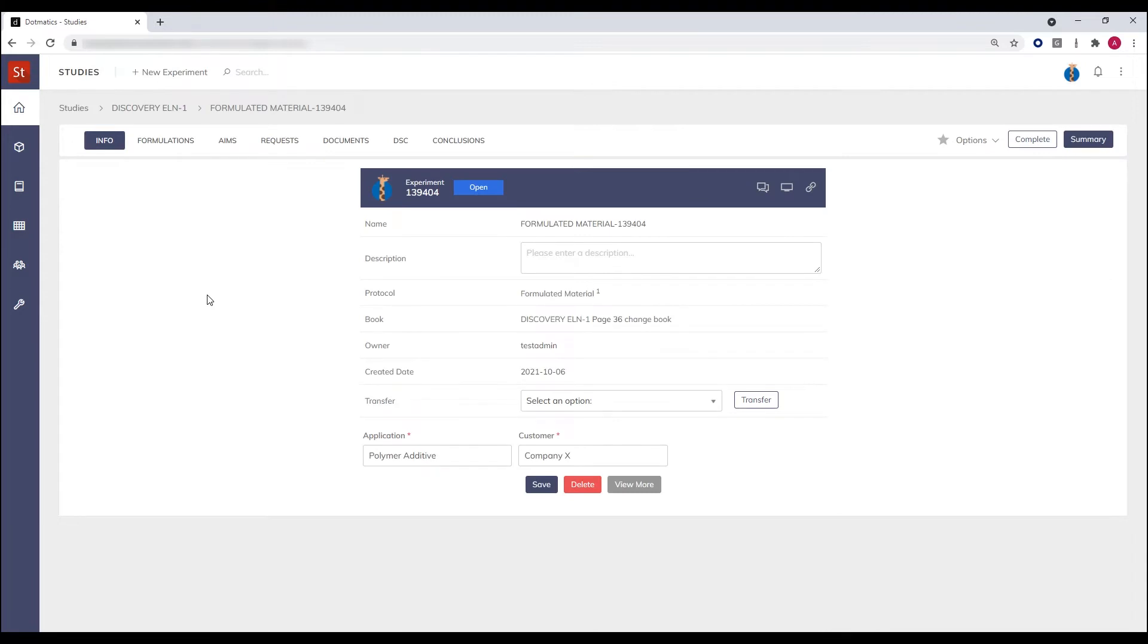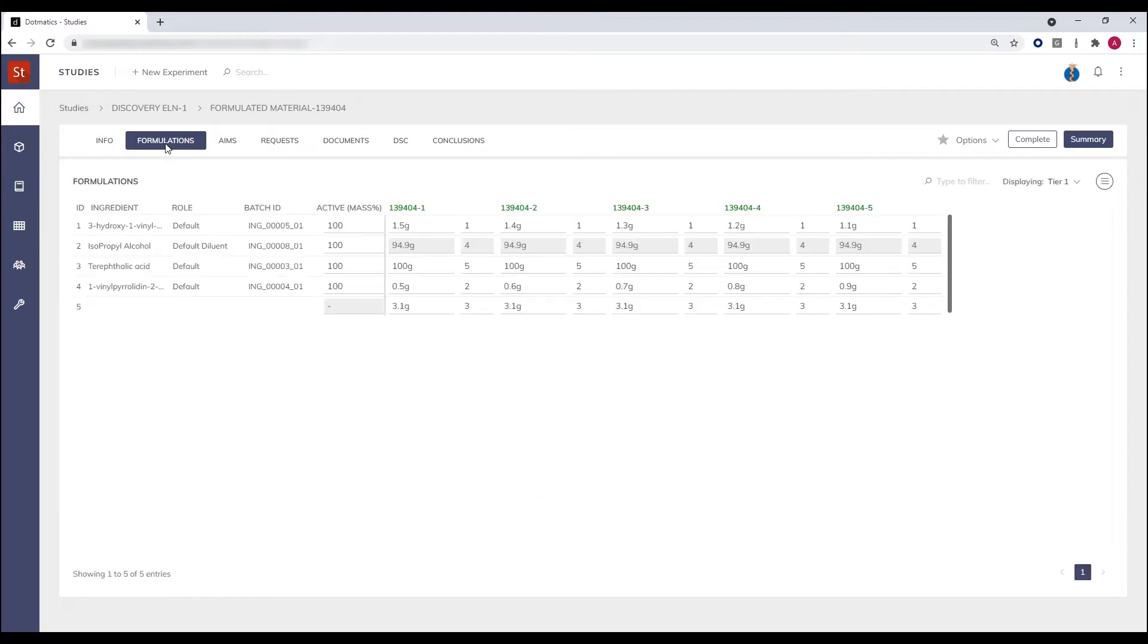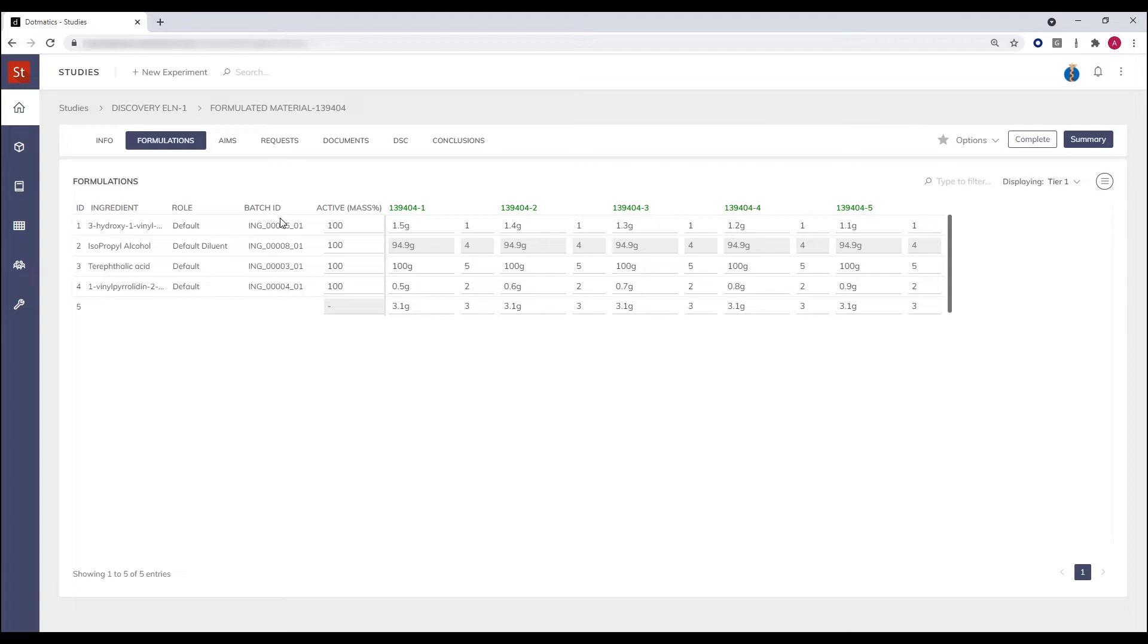By clicking on the experiment, we can see the experimental information page and identify all of the key metadata for this experiment. From the formulations tab, we can also see the materials that have been selected. Each of the ingredients listed, selected by the end user, is linked to the batch of that material which comes directly from the built-in chemicals inventory.